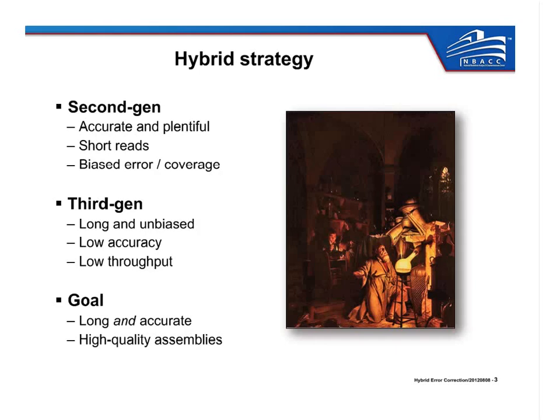So our question was, can we play alchemists here and combine these two basic elements to get something that's the gold standard? So the goal being both long and accurate, so that we can use the accuracy of the short reads to provide high quality base calls, but use the length from the single molecule sequencing to improve genome assemblies both by their length and their low bias.